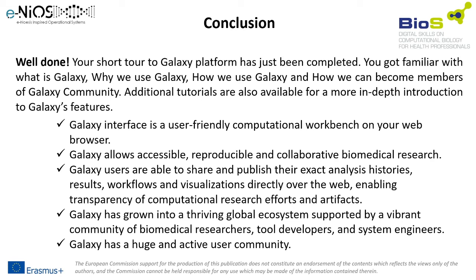Well done! Your short tour of the Galaxy platform has just been completed. You got familiar with what Galaxy is, why we use Galaxy, how we use Galaxy, and how we can become members of the Galaxy community. Additional tutorials are also available for a more in-depth introduction to Galaxy's features. And as closing remarks, keep in mind that the Galaxy interface is a user-friendly computational workbench in your web browser. Galaxy allows accessible, reproducible, and collaborative biomedical research.